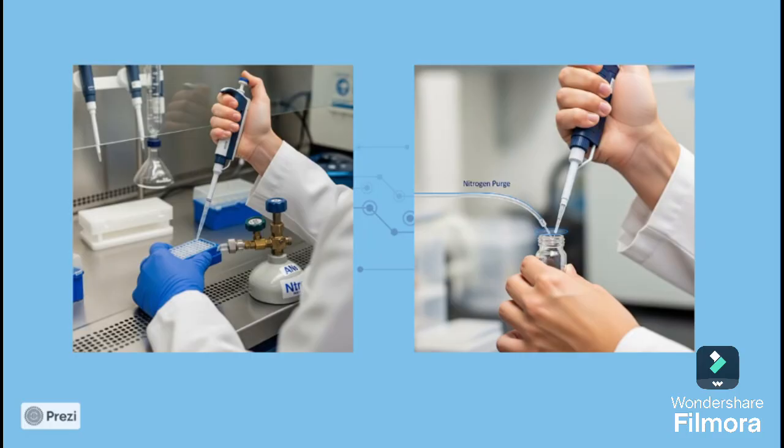Throughout the titration, nitrogen gas is passed through the solution because carbon dioxide from the air can dissolve in the water and form carbonic acid, which reacts with sodium hydroxide and affects the result by making it appear that the sample is more acidic than it really is. This means that this method is very accurate. It requires strict technical control, special equipment, and a lot of precision when measuring such small volumes.